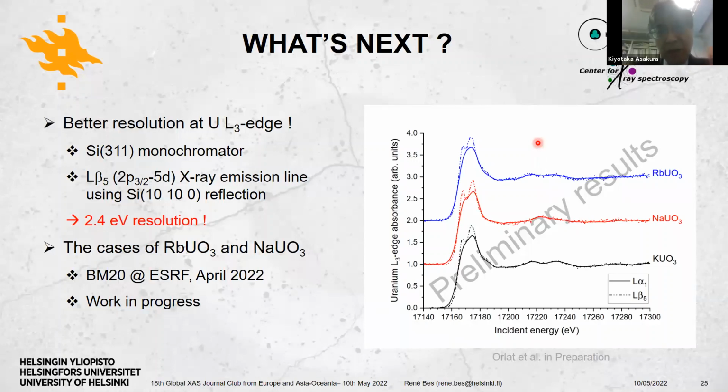So, can I ask? Sure. According to this picture, you showed, to my eyes, in the sodium case, two peaks, the split peaks are sharp. Yes. Or they were separated. Is the separation of the two peaks the same for the rubidium, sodium, and potassium?